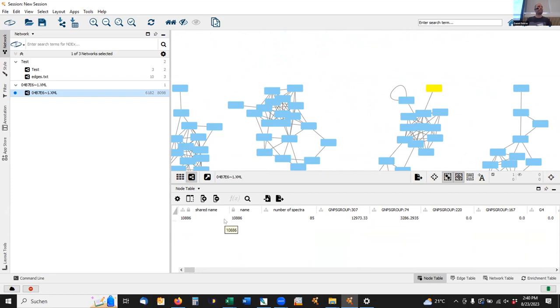All right. What's the difference if I'm downloading the direct Cytoscape preview for download, it's showing it different. So what's the difference between those two? I think the direct download shows you a preview. And then the GraphML should be fairly the same. It's just that here you don't show the pie chart.